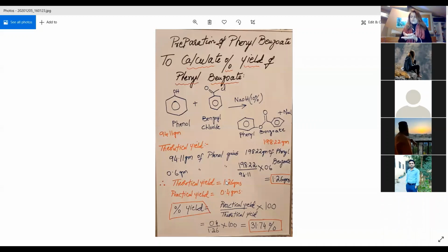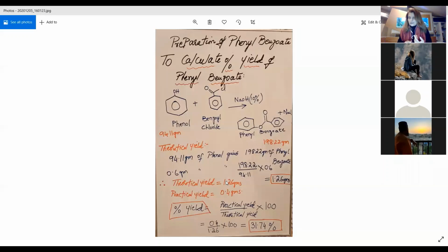And then you dried that compound, and now it is solvent free. The weight of the solvent is not there. That means the weight you get after weighing it on the weighing balance will only be of your compound. You will null the weight of the paper, and you will get the weight of your original compound. Whereas the theoretical yield is always calculated through the molecular weights of the compound, that is, your starting material and the ending product you got in the end.